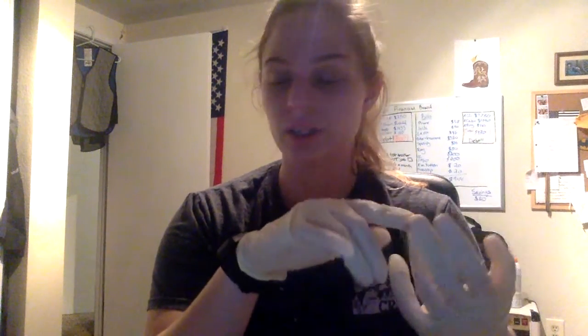So I'm going to go over the first part of the testing, which was the salt tolerance testing. We had 3 different categories: 1%, 7%, and 15%, to check how our microbes would do under different salt concentrations. We are basically testing to see which microbes are, forgive me if I pronounce this wrong, halotolerant or halophils. The halotolerant would be positive because they are able to survive at high salt concentrations because they don't need those conditions to survive. Whereas halophils, they need the high salt concentration or they don't grow at all.